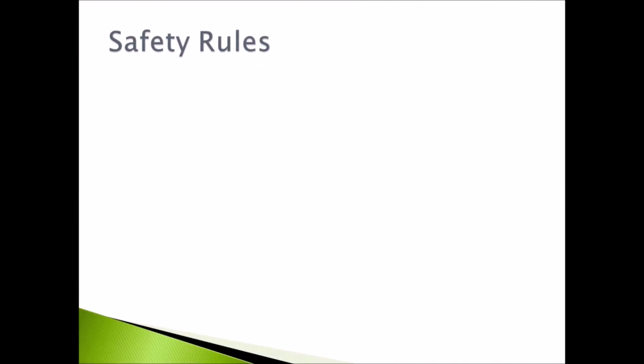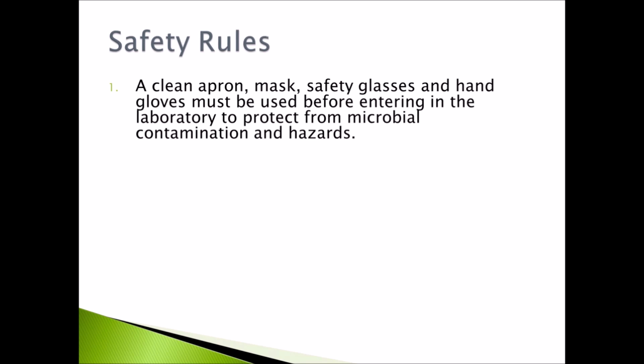Now, about safety rules. There are various safety rules which must be followed in the laboratory, and they are listed below. Number one, a clean apron, mask, safety glasses, and hand gloves must be used before entering the laboratory to protect from microbial contamination and hazards.